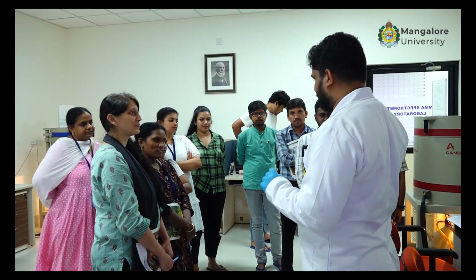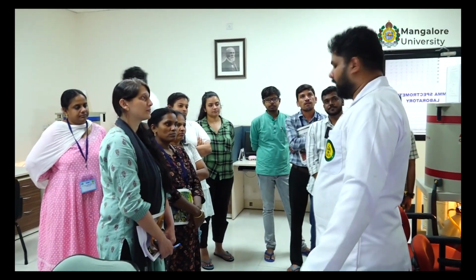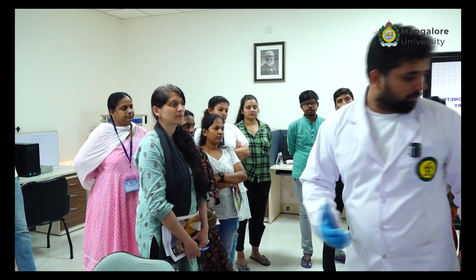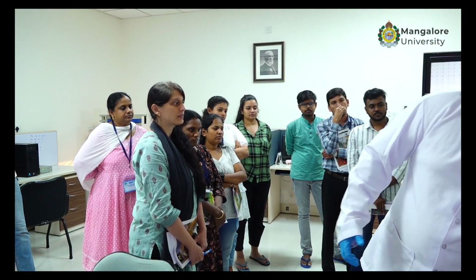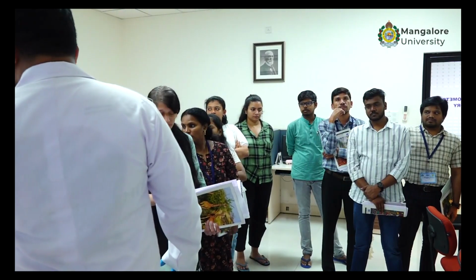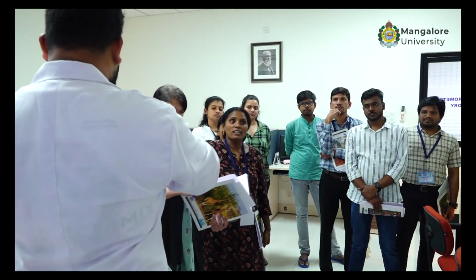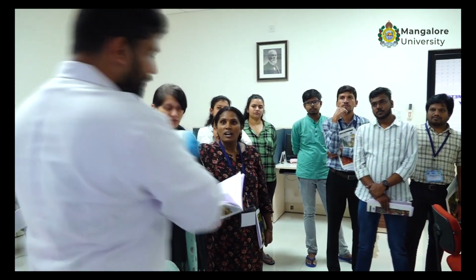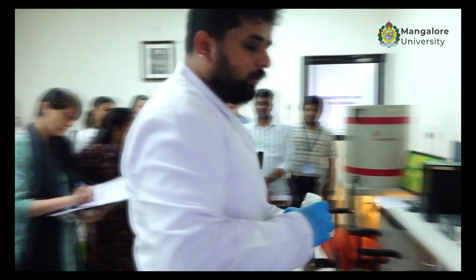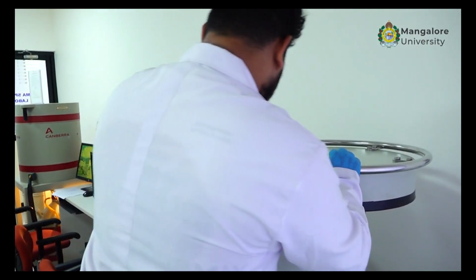So I have shown it on the first day. Even then, I can show you a cesium spectrum at a later stage. We can develop it right now if you want, or I can do it later also. So let us start with that. Just give me a cesium sample. So I'll keep all three together. Like two together, cesium and cobalt. So let us see. More than the 4 because the coincidence will also occur.